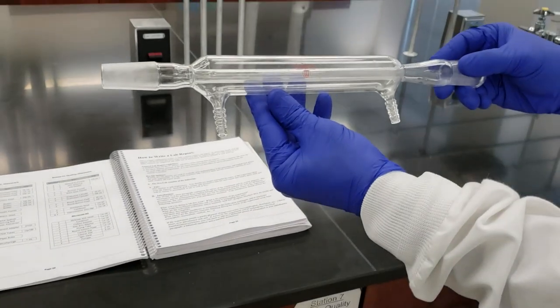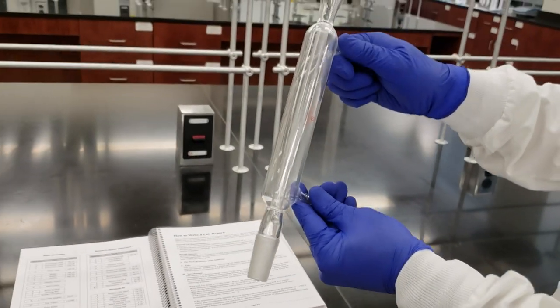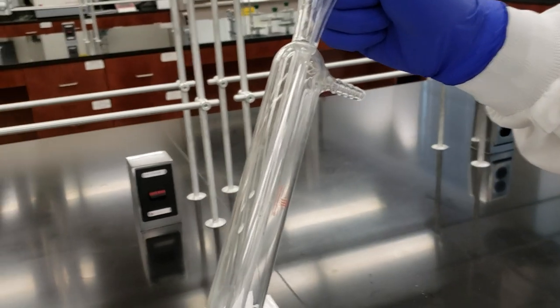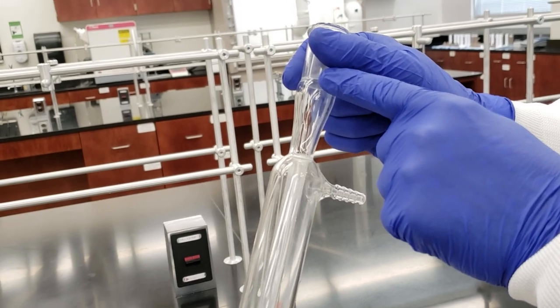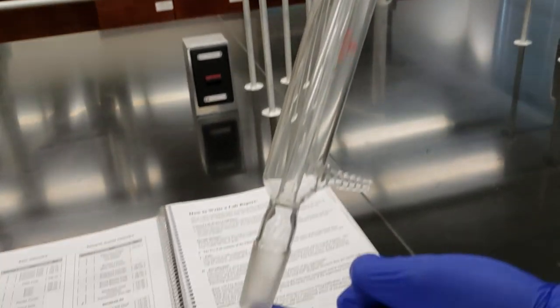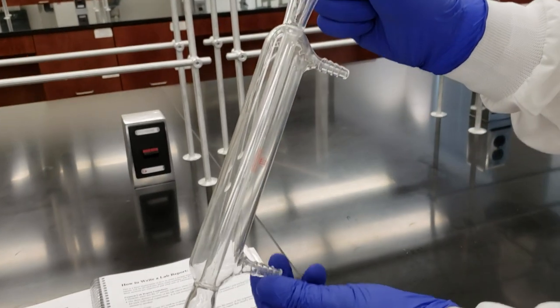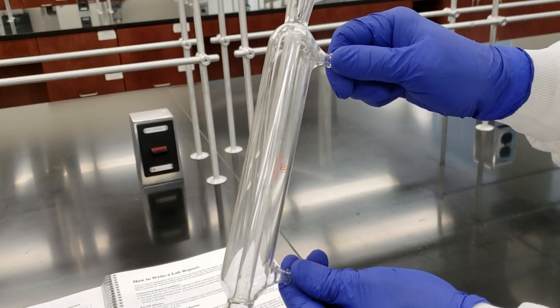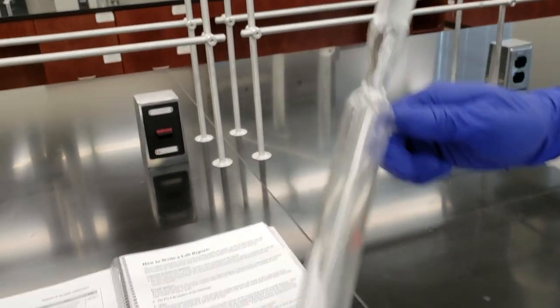We have two condensers, double jacketed condensers. On the interior there's a straight tube through the center connecting top and bottom. The interior with inlets and outlets allows us to flow water through and cool the vapors traveling through that center tube.